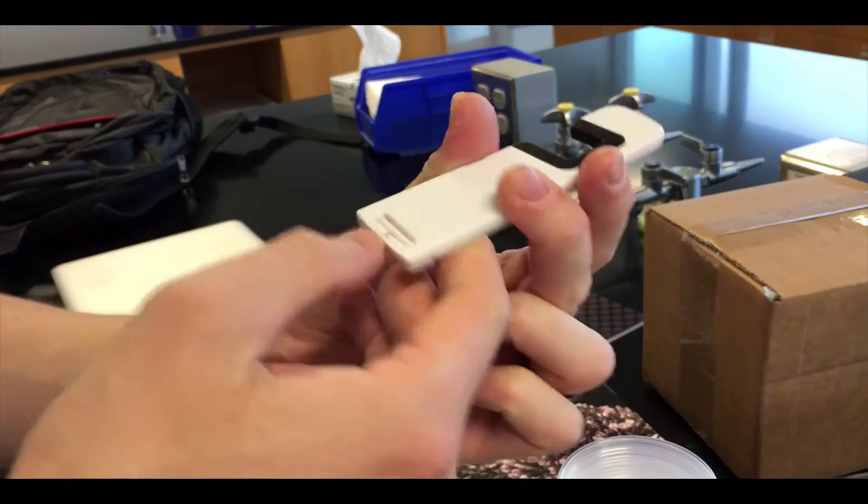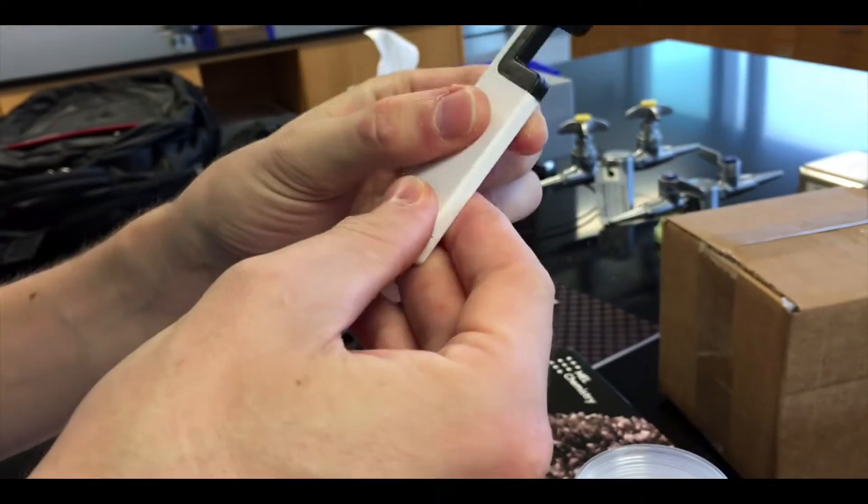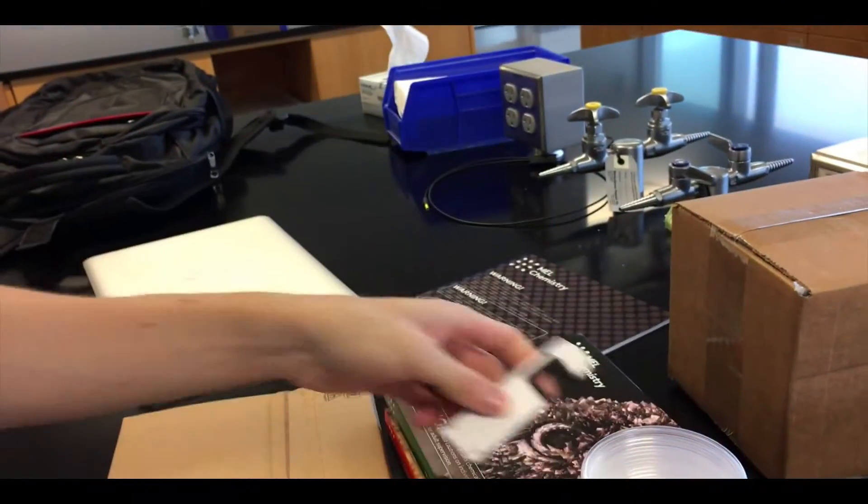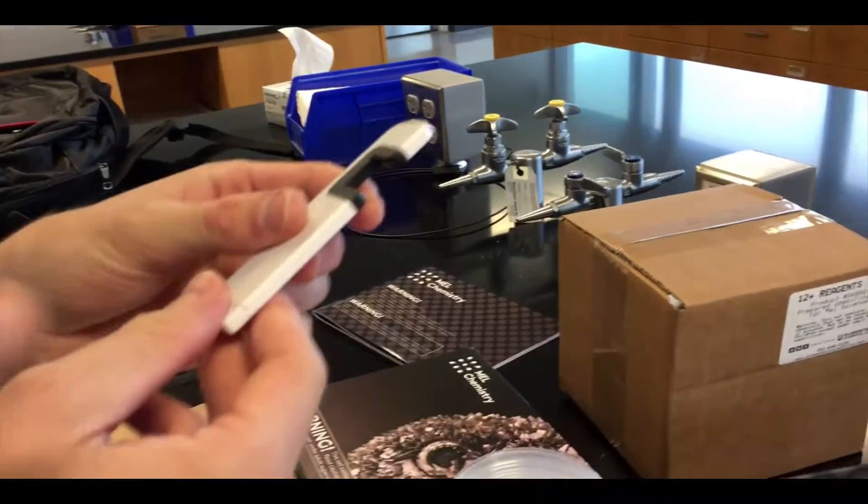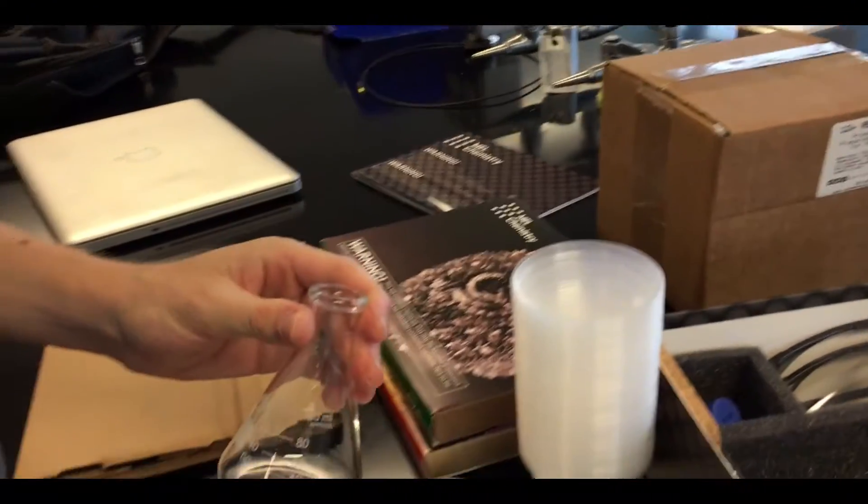This I have no idea what this is, but it looks like one of those things they used to put in Happy Meals back in the day that you could fold into something else. We got a funnel and an Erlenmeyer flask.